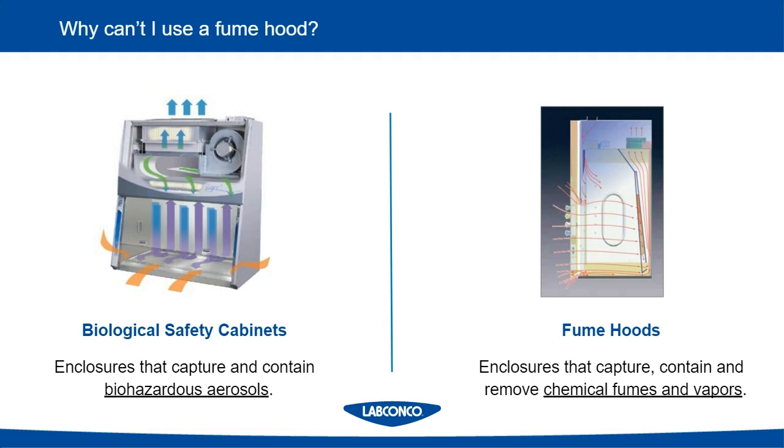When somebody asks me if they can use a fume hood for their work, I always like to break it down to a very simple question. And that is, are they trying to trap chemical fumes or vapors, or are they trying to trap some type of aerosol? For biohazards, that could be a virus, a mold, a bacteria, a fungus, anything like that. Any kind of particulate-based hazard is what we would be talking about there.